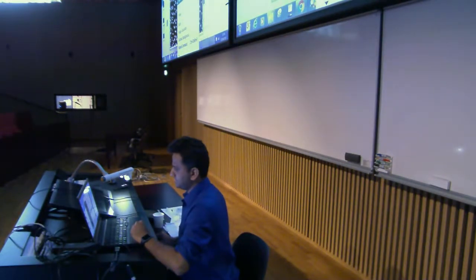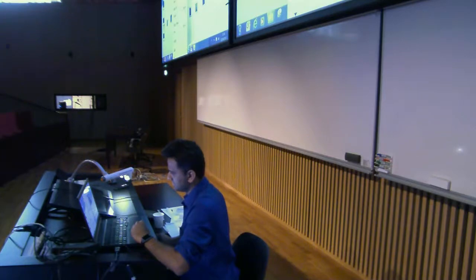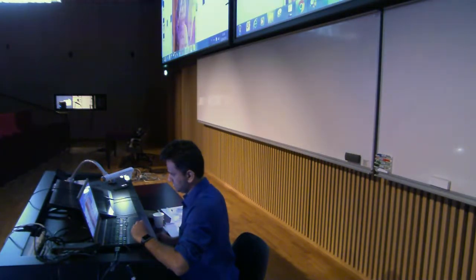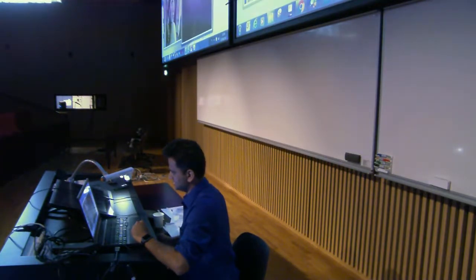Process, FFT, maybe this is important if you want to do some kind of frequency domain filtering. Let's look at it, not with this data, but maybe with this it makes sense. So if you go to, where's this, Lida, and make this image type 8-bit, which is a grayscale now. Now it's not RGB, but if you go to process, FFT, I'm just making the Fourier transform. So the Fourier transform of an image is like this.